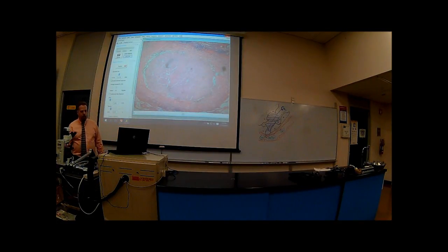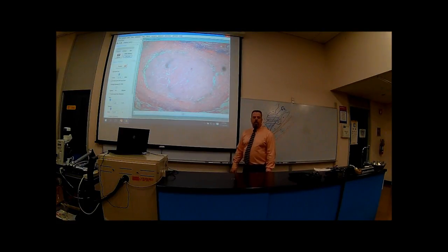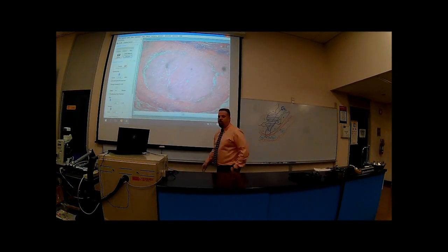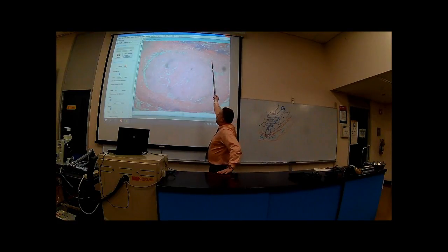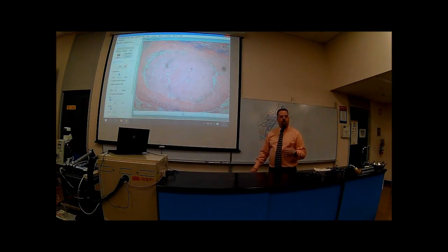Okay? What you're looking at is a tubercle. This is tuberculosis, or TB. You could write TB on your tests, should that be asked. We talked about tuberculosis before, but what's happening here is that we have this area where the bacteria sits in a vegetative state because the immune system in the person is so great. So it kind of sleeps until the immune system decreases. And they wall them off with this barrier around here. You'll learn about this when you take microbiology, so that the immune system over here, macrophages and stuff, can't penetrate this wall to destroy this. So they're pretty smart. They go into a vegetative state, almost like a coma, and can sit there for decades and decades and decades until the immune system goes down.